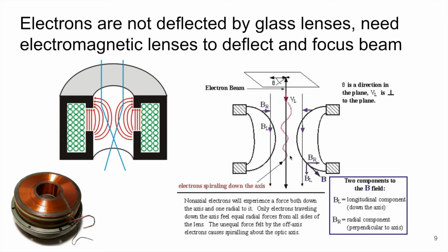So basically doing what it's showing here, we'd have two of those for that. And so that takes us to the fact that we have this beam and we're creating a much narrower diameter of that beam. And so next we want to look at the probe size, the beam size, and current, and see how all of these things are affected.